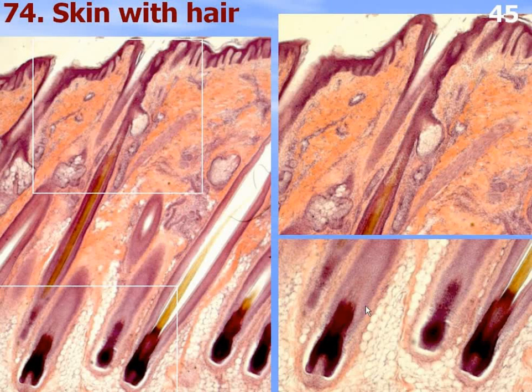The sweat gland wall consists of inner and outer epithelial layers surrounded by connective tissue.